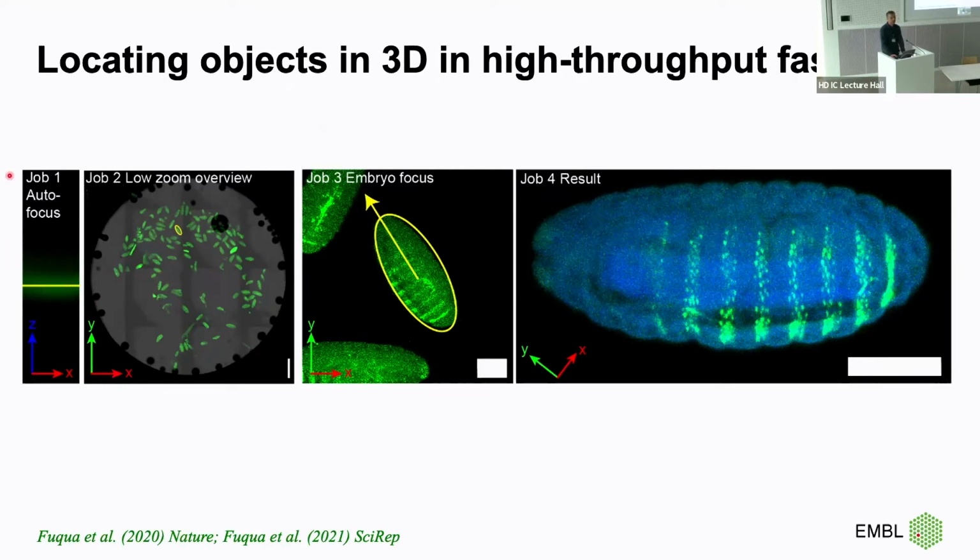So first we had the XZ scan for the reflection, right? We just identified the cover slip as you would always do. Then using the feedback microscopy, we define the Z level, and based on that, we acquired the low resolution image, which was in focus, with a 5x low NA objective. Then this image was acquired and automatically processed.